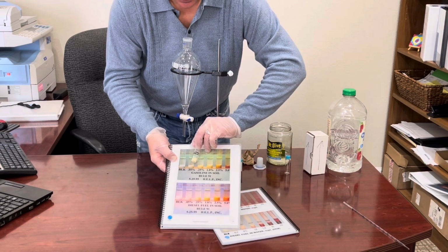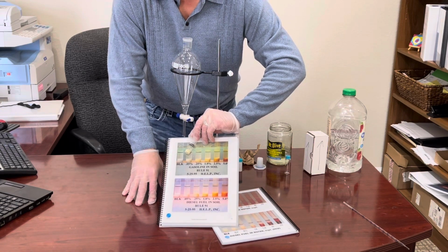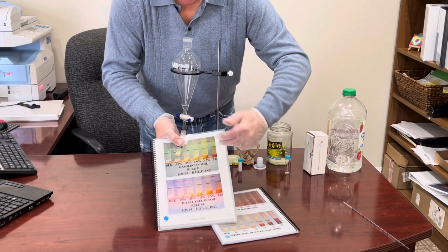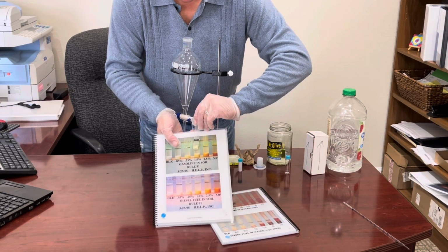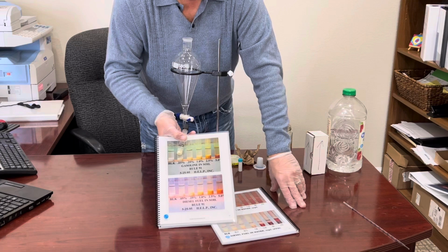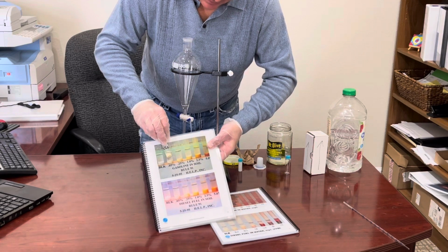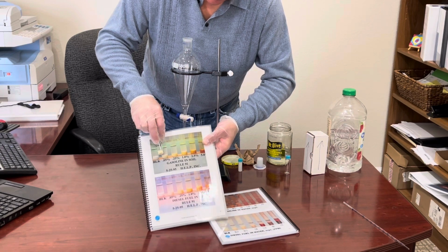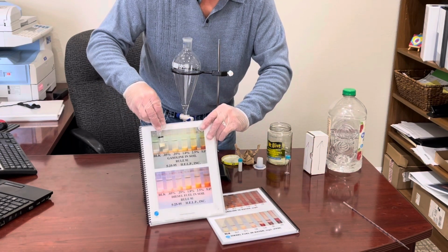So as you can see here, our high range is in percentages. So as opposed to ppm, our high range solvent, which is a weaker solvent, where 1% is 1% of a million. 1%, if it was that color, would be 10,000. Likewise, 0.25% would be 2,500, and 0.05% is 500. And as we can see, we're more in line with that 500 ppm, if not even a little bit less, in between the blank, which just represents 0, and the 0.05%, which is 500.